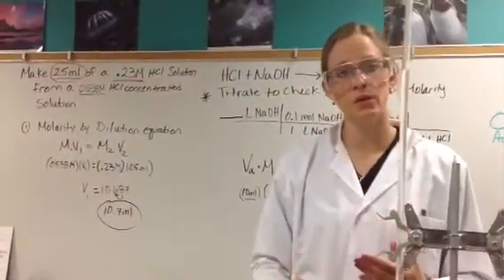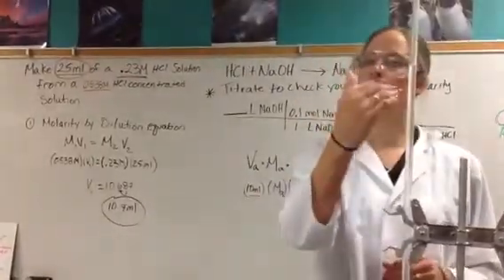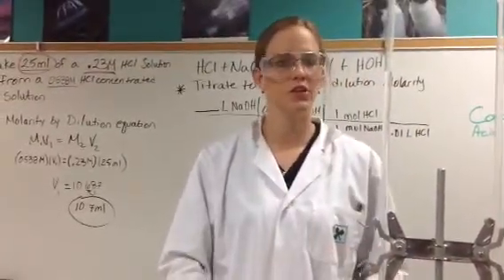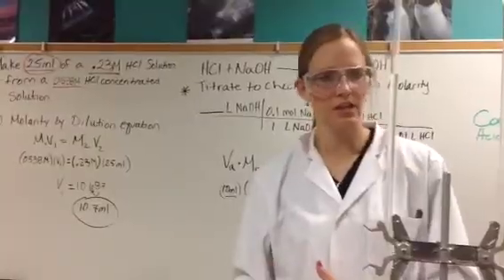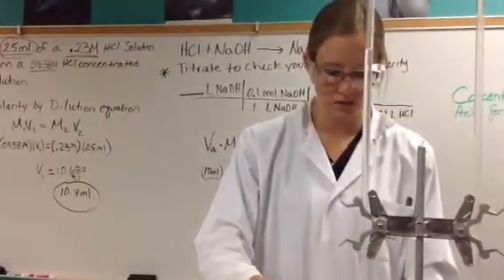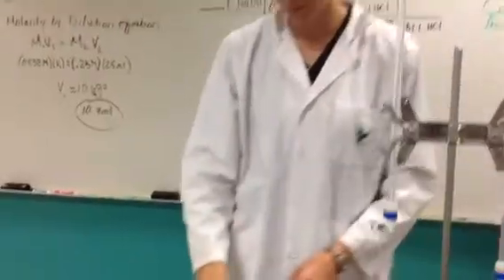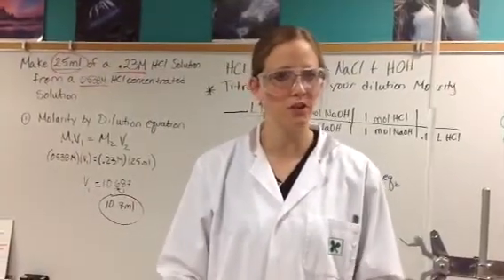Read and record your start value, then calculate your end value — if I need 10.7 mils, I calculate what my start value is and figure out where I need to stop. If you go over, you have to start over because you won't have the correct concentration. So be careful. Get your acid into your graduated cylinder, then record your final volume. Even though I know I want 10.7 mils, recording your start and end value is still good lab practice — you want all your data points down.